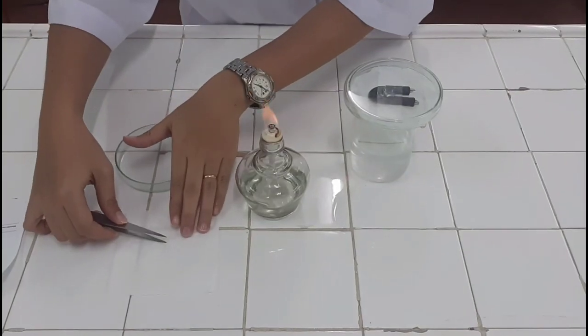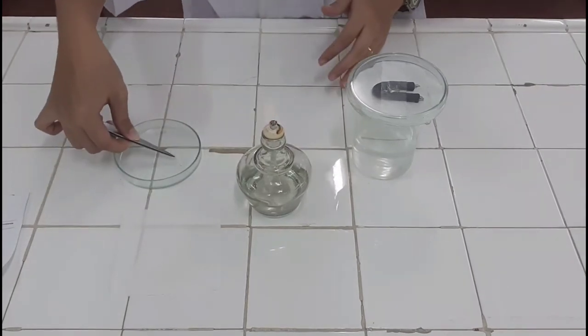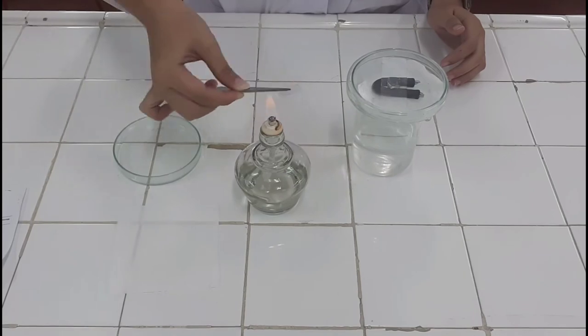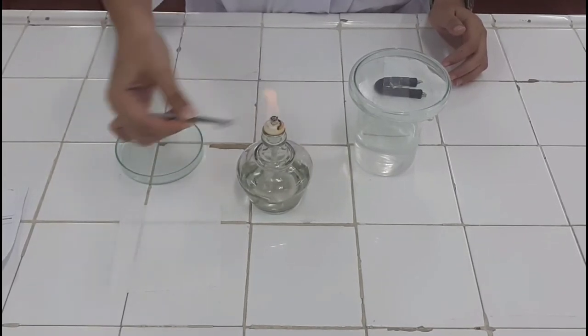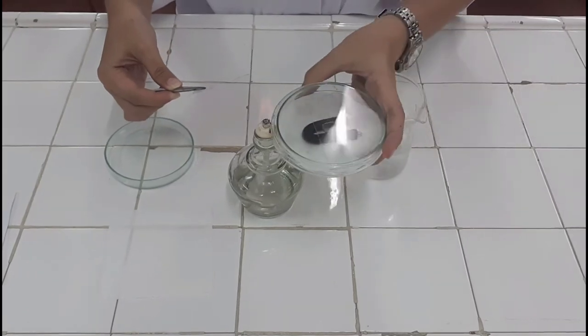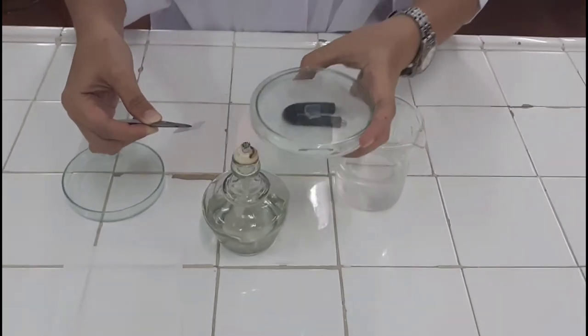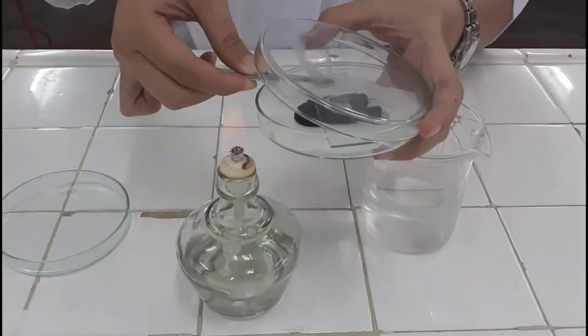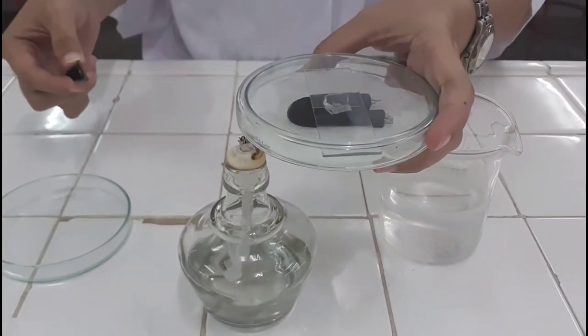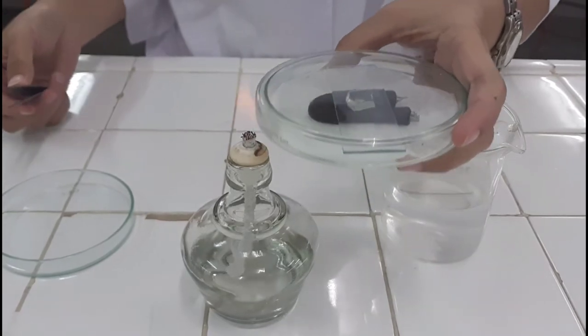To place the cover slip, dip it first in 95% ethyl alcohol, then flame. Allow it to cool for a while and place it on top of the agar block. Then, the agar block is set.